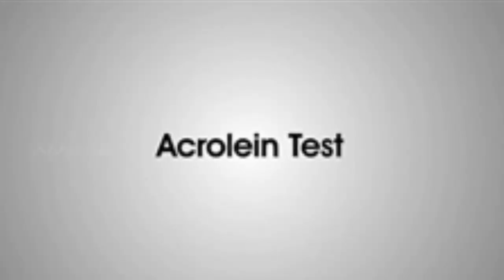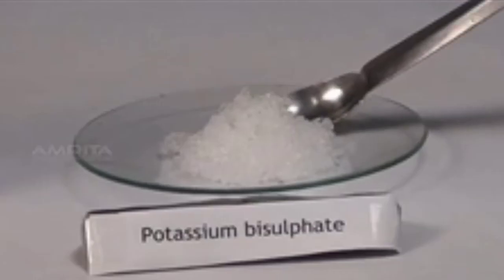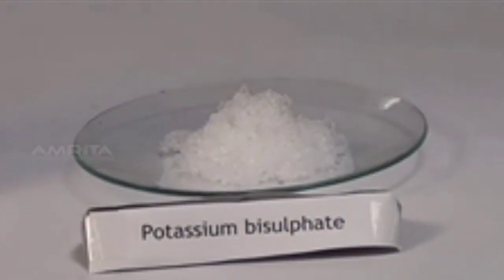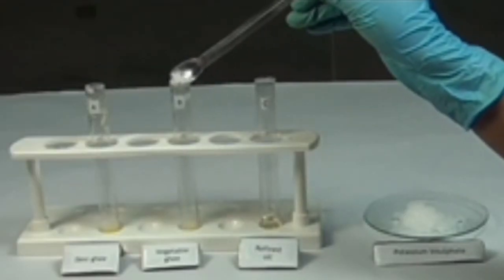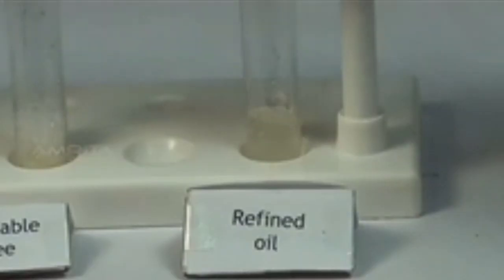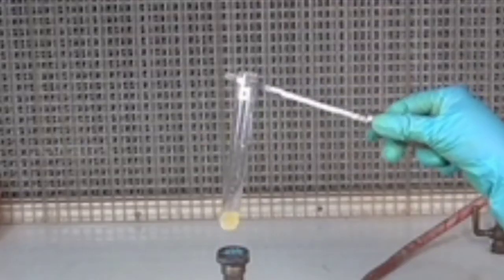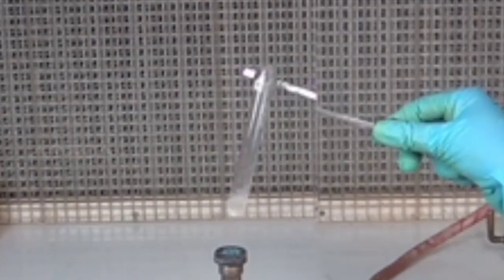Acrolein test. Take a small quantity of desi ghee, vegetable ghee and refined oil in 3 test tubes A, B and C respectively. Using a spatula, add a small quantity of potassium bisulfate crystals into test tubes A, B and C. Now, heat each test tube over the Bunsen burner.